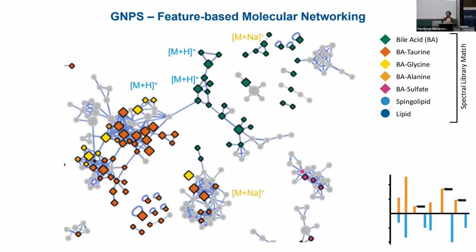And why do we have those different adducts in the first place? Because during the ionization, of course, we can protonate, but we can also add basically every cation to our molecule and ionize it this way, right? If we have some acid group, it's definitely going to be prone to capturing some of those cations that we have there. So those networks are going to be the basis of what we're going to work with downstream here.